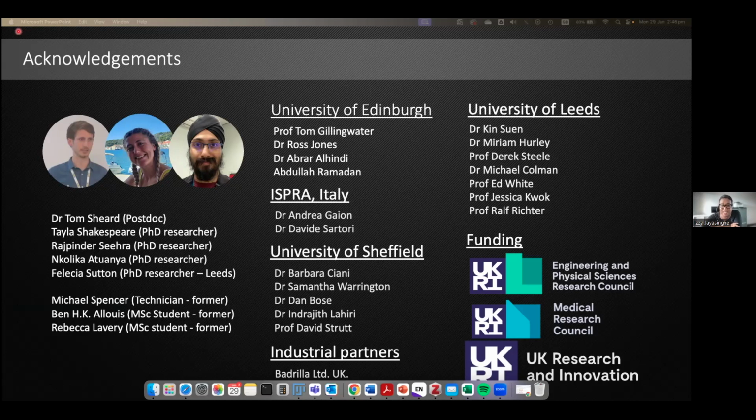We found this out, especially in the process of developing this work to publication. One of the things that we did was we repeated the imaging of the same cells at different time points of the expansion protocol, so we were imaging these structures at least 3 times. Often the 3 images are not complete; there will be an overlapping region. But I think the general principle of returning to the same location and imaging is a good thing if you can master it. Certainly a bit of skill involved.